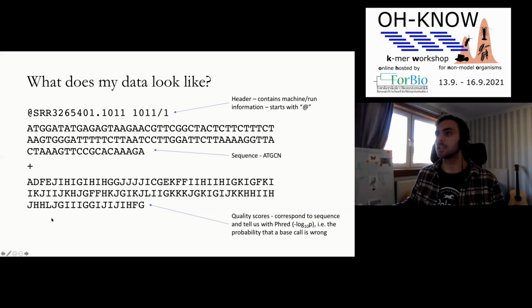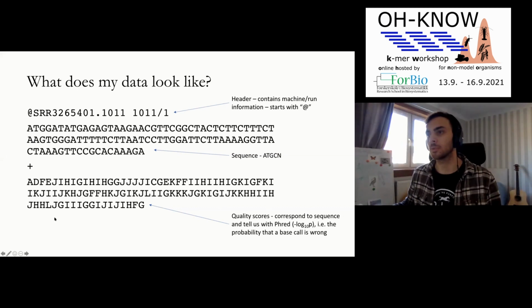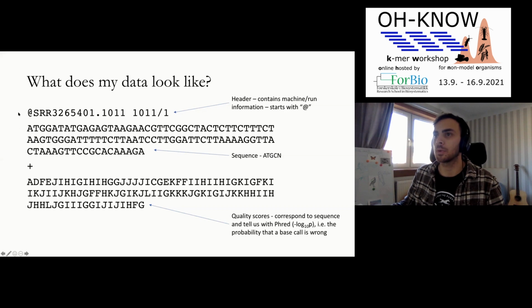So what does my data look like? More often than not, you will end up with a file like this from the sequencing machine or from your sequencing center. This has obviously had some stuff done to it first. The machine doesn't just spout this out, but typically you will get it in this format. And what you end up with is, at the top here, you have this header line, which contains the machine information, normally some run information, and whether your read is a forward or reverse strand is also often kept here. So I think in this case, this is what this one is for. And that header will always start with an @.